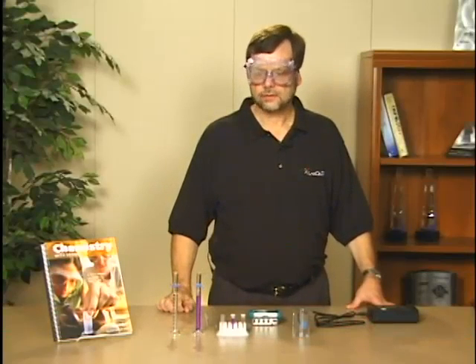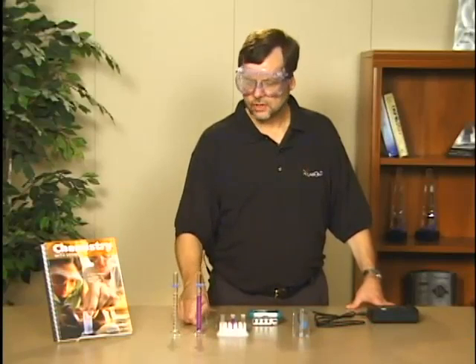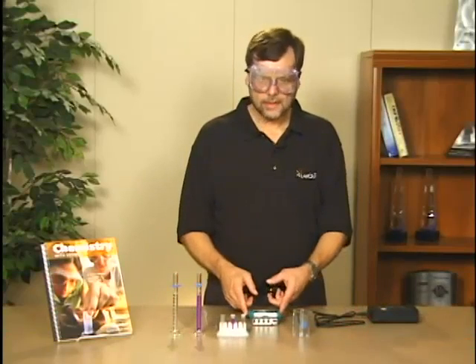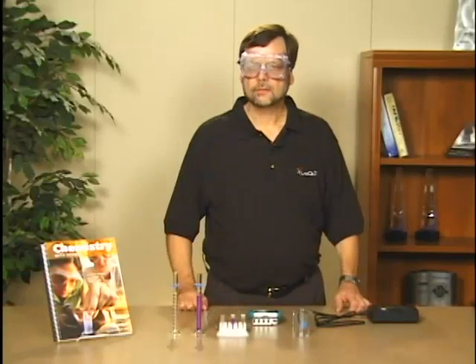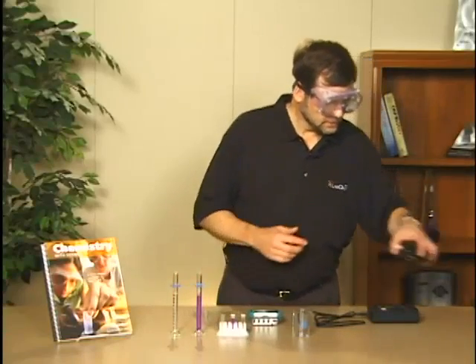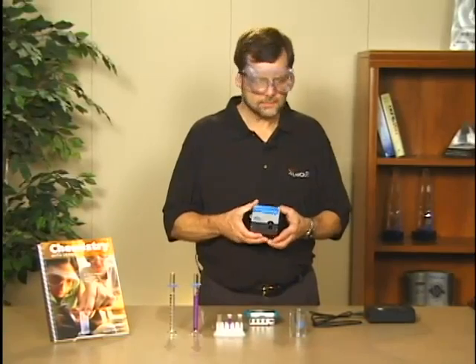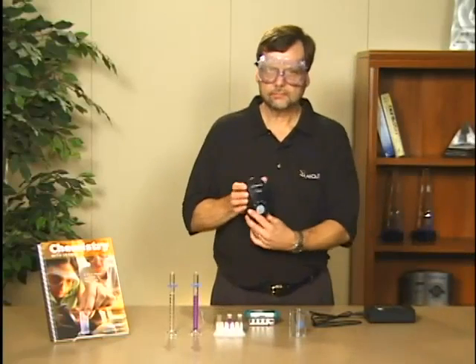As the reaction proceeds there's a change in the violet color that we're going to monitor using a LabQuest and the SpectroVis spectrometer. The reaction can be monitored equally well with a Vernier spectrometer, one of the Ocean Optics spectrometers, or it can also be done with the Vernier colorimeter.